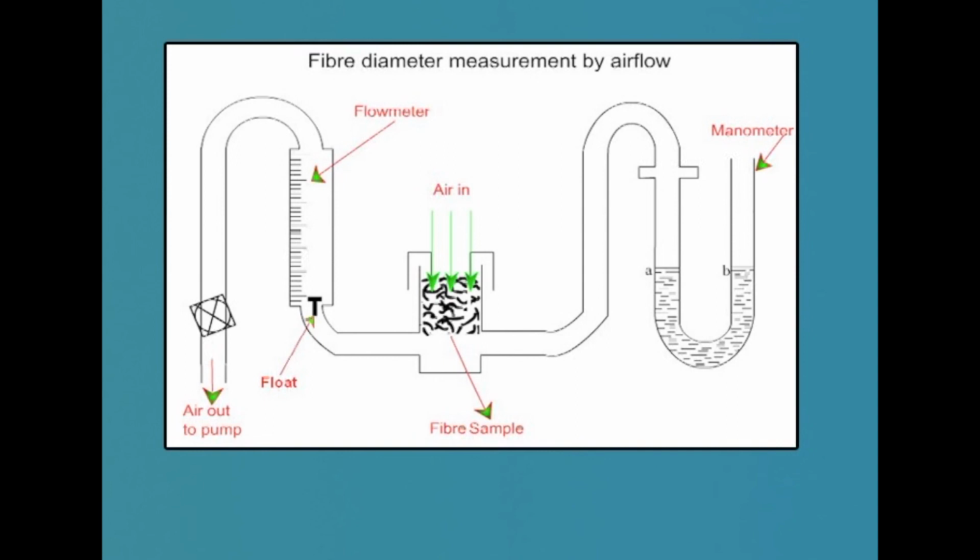This rotameter type of flow meter is not calibrated directly into units of flow, but it is calibrated on the basis of experimental work on samples of American upland cotton. The scale has been marked in terms of fiber weight in micrograms per inch. Other instruments mentioned work under the same principles. In Atira and Citra, fineness testers and calibrations are done by using Indian cottons.